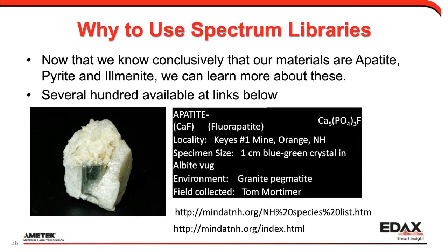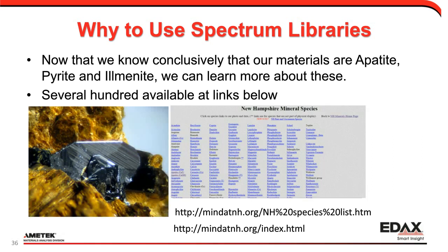And just a couple more examples and some images from the ilmenite and some of the great many number of materials that are available on the search.